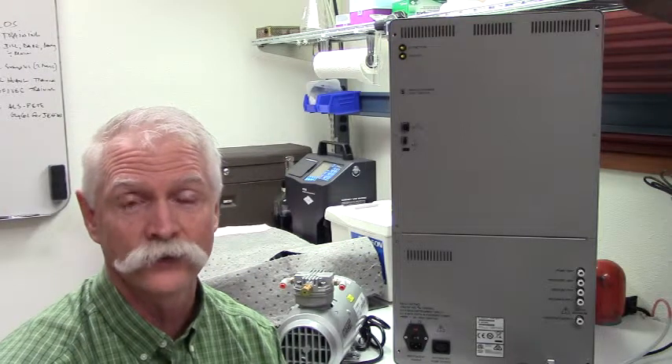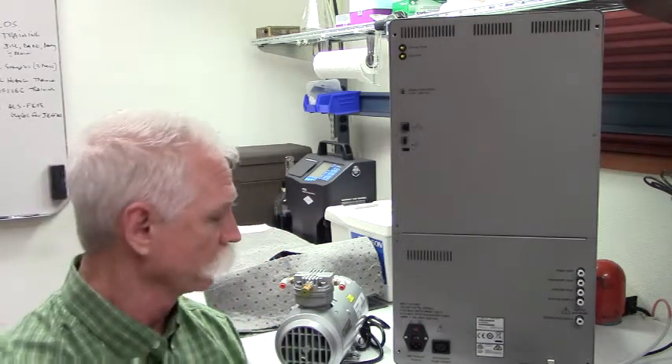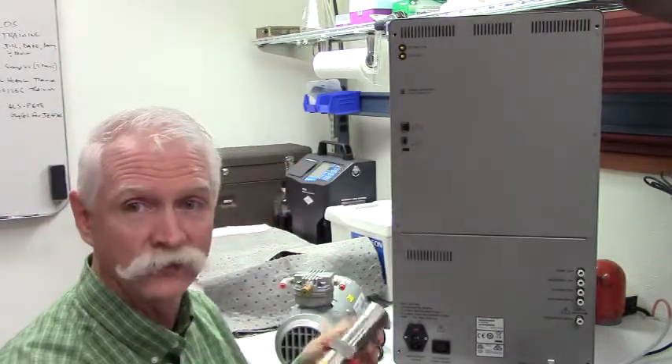Hi, this is Bill Bars from the Application Lab. This is an instructional video to help a user set up their 8011 Plus for the very first time. After you pull the instrument and its equipment out of the box, it really consists of three major components: the 8011 Plus itself, a compressor pump, and the HRLD sensor.